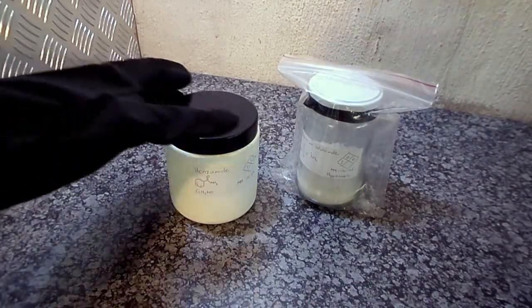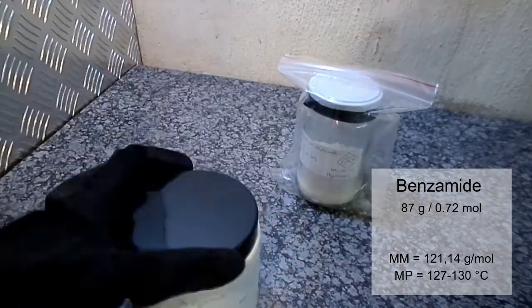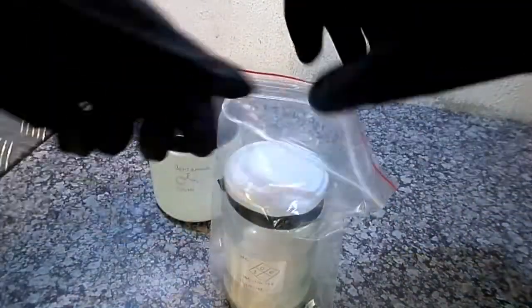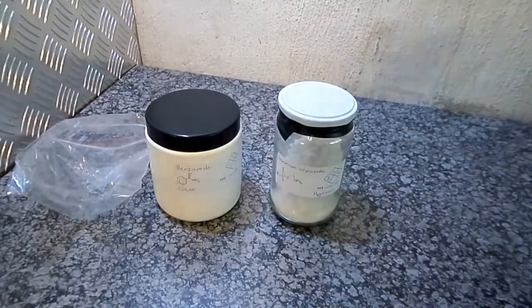In this synthesis I'll be using 87 grams of benzamide along with 100 grams of ammonium sulfamate, both of which I've made in a previous video. Ammonium sulfamate is used in slight molar excess in order to maximize our yield from the starting benzamide.